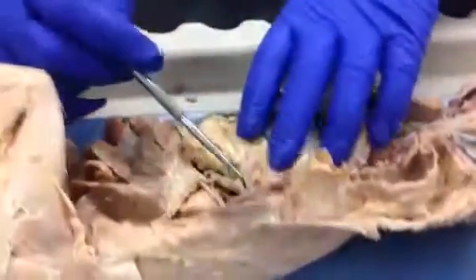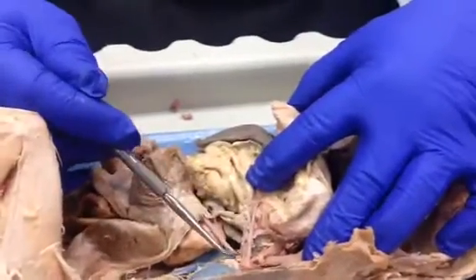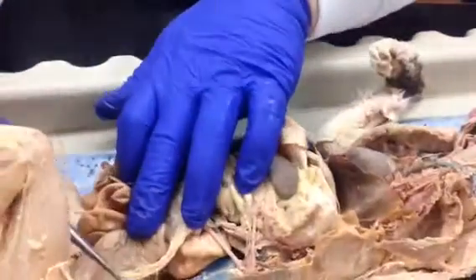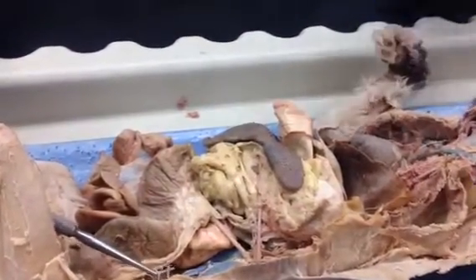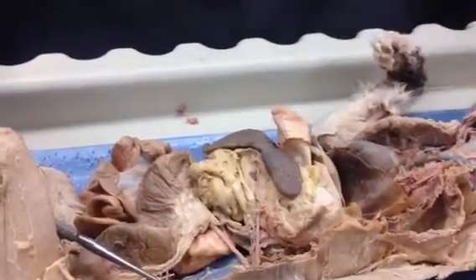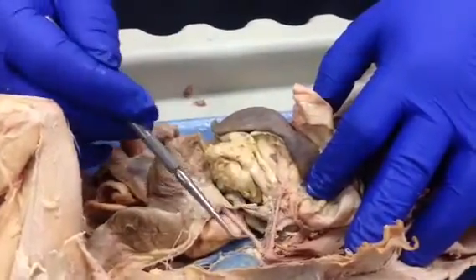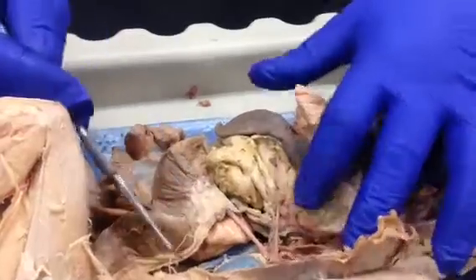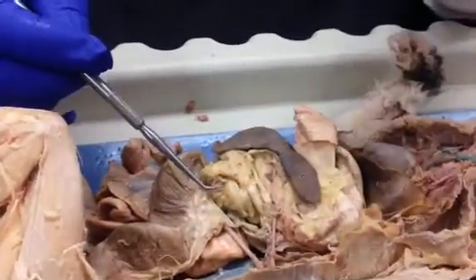Okay. You pull up on all the organs like this, and you'll see an artery that comes straight up, another one comes straight up, and there should be one more. This one's broken. There's a little stump of it right here because it was so tiny. Okay, there's 3 that come up to the organs, and that's the way it is in a human too. We have the celiac, that begins with a C. Okay, then we have superior mesenteric. And then this tiny one, which goes directly to the colon, is the inferior mesenteric. So those 3 are always present.